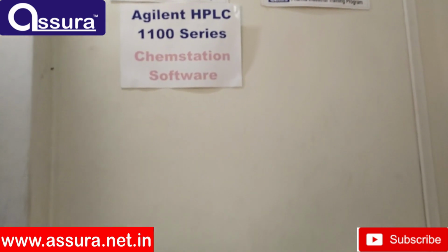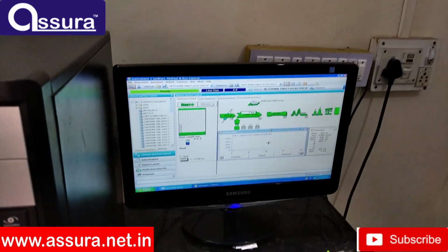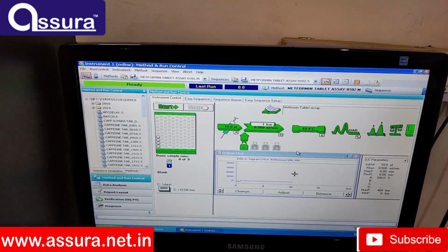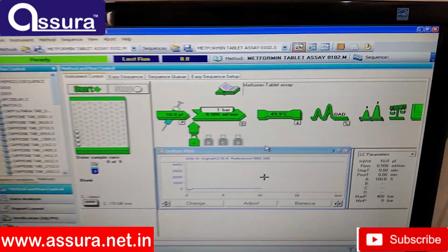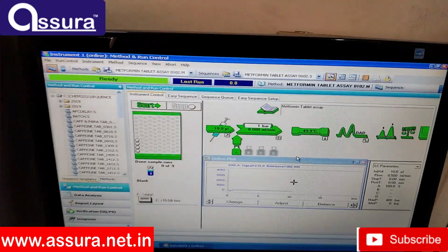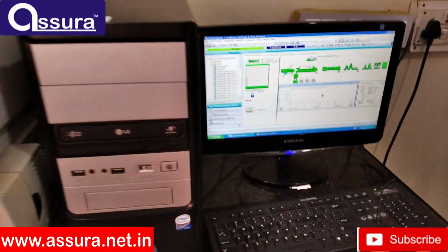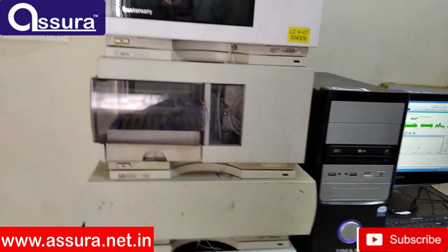The software used in this HPLC instrument is ChemStation. All analysis, chromatograms and their data are controlled by this software. This software helps us to run the HPLC system for 3 to 4 days without any problem. We can set all the parameters of a particular product in this software to run the specific method. So now we will see stepwise all the compartments involved.